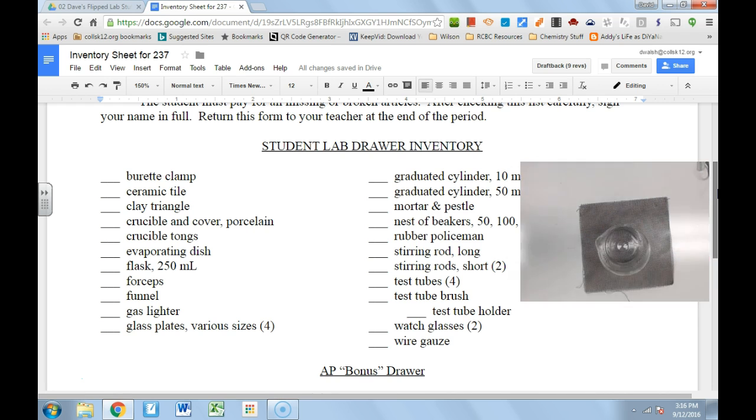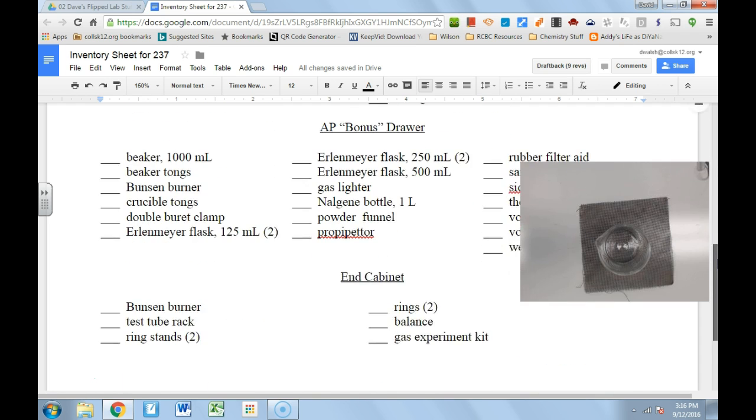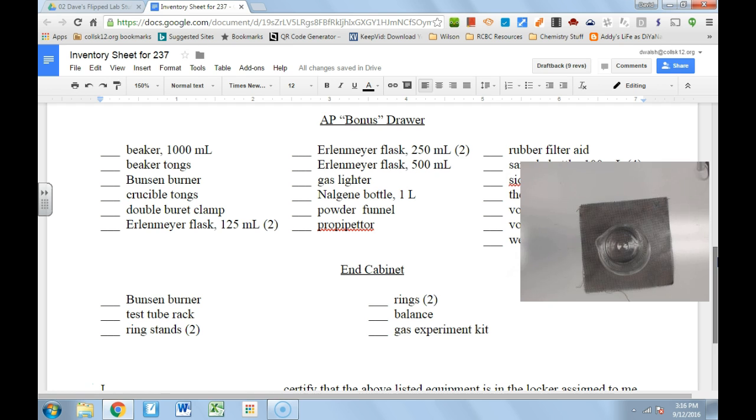So that's what you're going to find in your regular lab drawer. We also need to talk a little about the end cabinet — you won't do the AP bonus drawer unless you're in AP chemistry, and there's a supplemental video for that — but there are also things in the end cabinet, so let's go over those things.